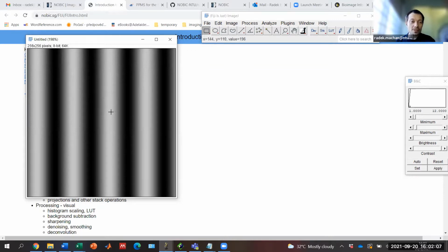Not so obvious is that this spatial frequency description is applicable to any type of image, because any distribution of objects can be described by a sum of harmonic periodic functions. So even something which is not periodic at all can be described as a series of periodic functions. Of course, to fully describe it, we would in principle need an infinite series of harmonic functions. But it is, in theory, possible.